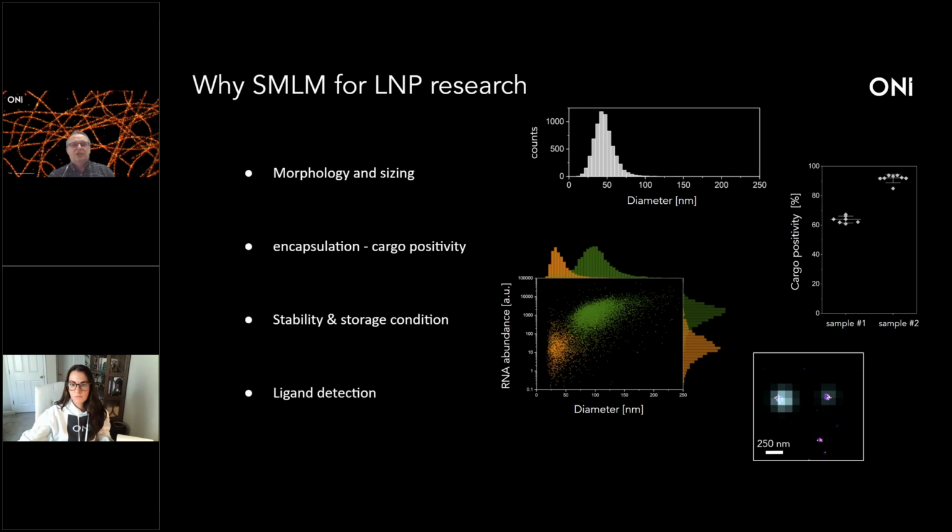For the second question, it's not easy to get a fluorophore for the 488 channel which performs very well with single molecule localization microscopy. In this experiment, we are using the 488 channel to detect the cargo, and that's actually diffraction limited, as you can see here in the cyan. So we are using the 488 channel as a diffraction limited channel.